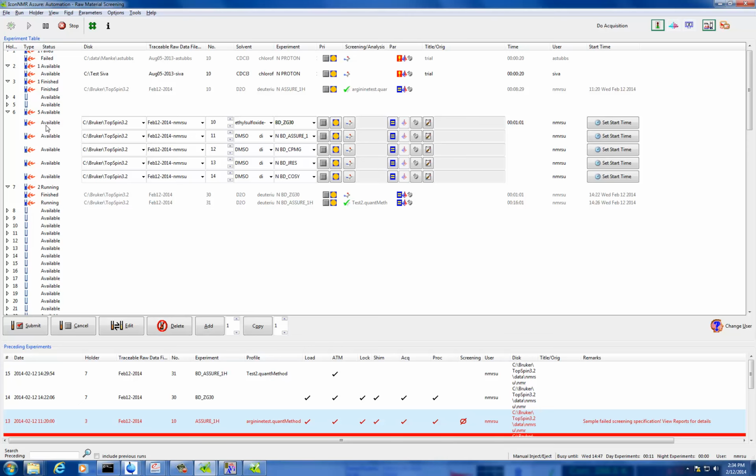That whole series, how long does it take? I think 6 hours. I'm assuming 8-9 hours. Carbon's 5 hours. So they have to be done at night. So we will get a lot of spectra from this series, right? Each run we can get one spectrum, right? Each one is one spectrum.